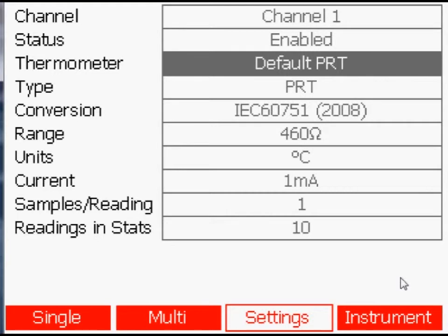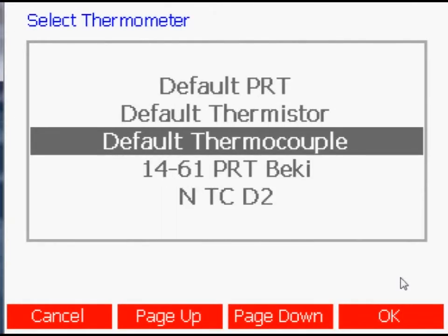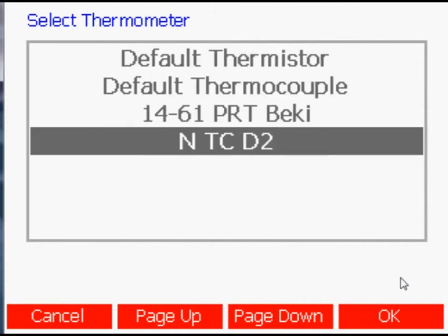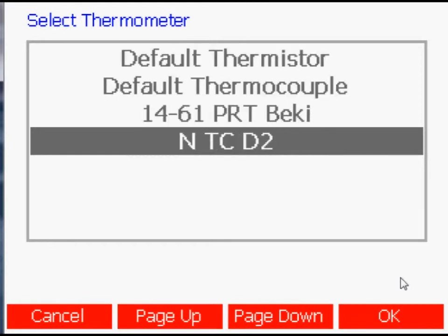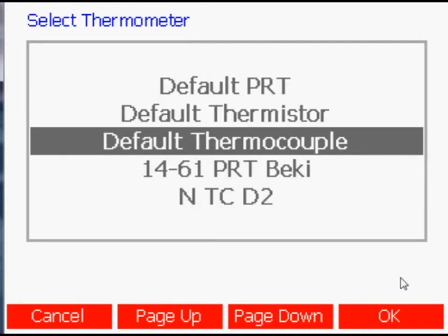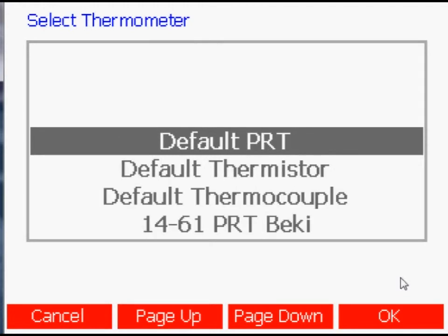Pressing the Enter key when the thermometer parameter is selected opens a window with a list of all the thermometers in the MillerK's database. Use the up and down arrow keys to highlight the correct thermometer and press the OK key to select it.